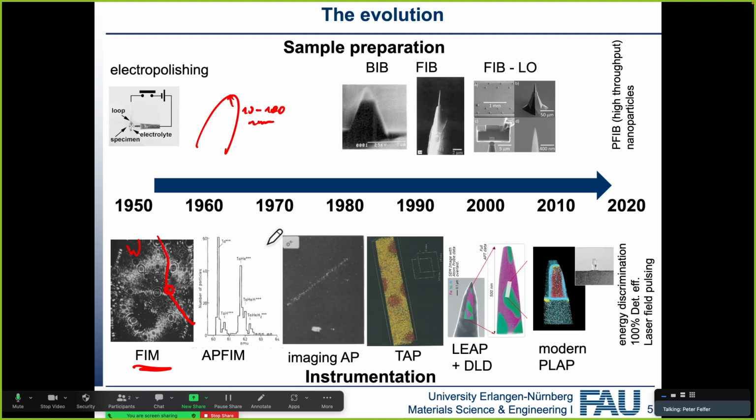And I actually wanted to buy a pulser with 500 kilohertz or 1 megahertz. But the problem was that then Russia attacked Ukraine, and the people that built my nice pulsers live in St. Petersburg, so I'm not allowed to buy anything from them anymore. So that's why we're stuck with 200 kilohertz for now.